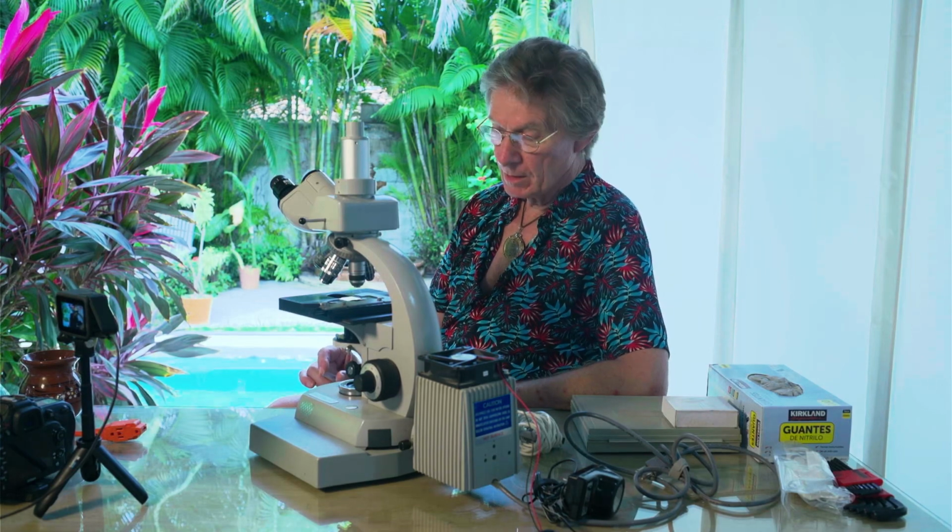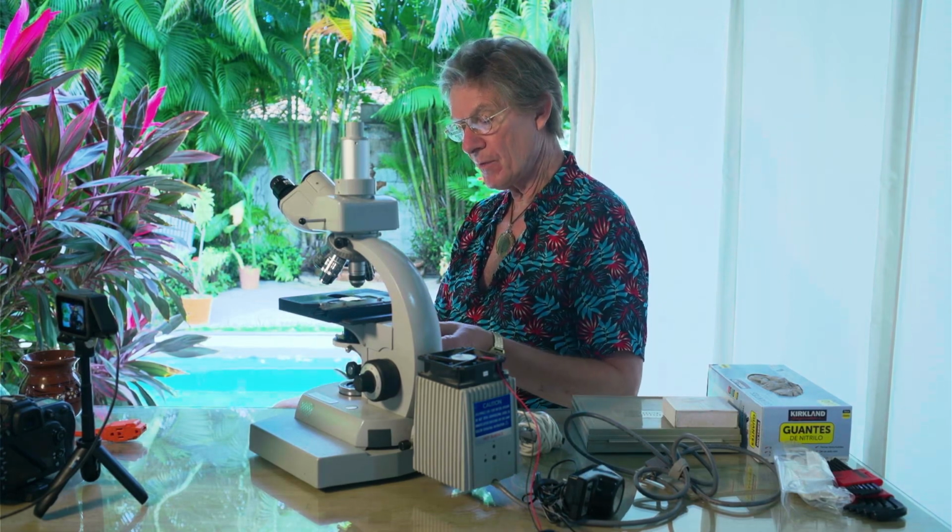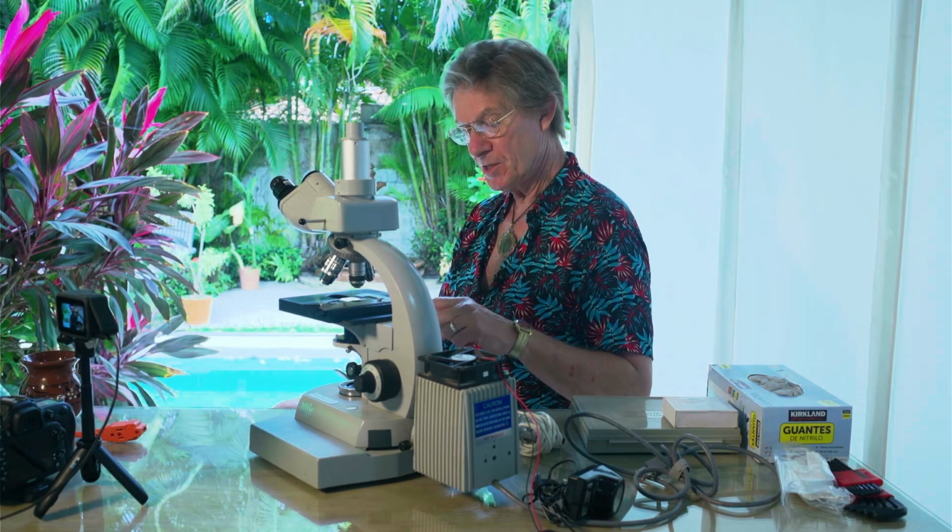So I learned a very quick lesson, and I learned that non-ionizing radiation in this sample on the microscope slide was a significant indication they had exposure levels that were way too high. And that's when I started questioning people about their exposure and advising them on how to mitigate that exposure and clean up their electromagnetic environment so that they weren't compromised and that their health would improve. So that's just one example of an artifact. So artifacts can be dust, they can be dirt on the slide.